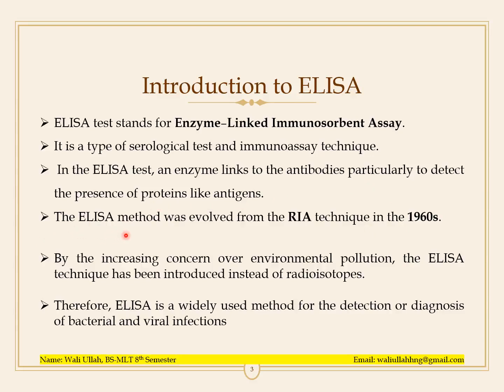The ELISA method was evolved from the radioimmunoassay technique in the 1960s. By the increasing concern over environmental pollution, the ELISA technique has been introduced instead of radioisotopes. Therefore, ELISA is a widely used method for the detection or diagnosis of bacterial and viral infections.